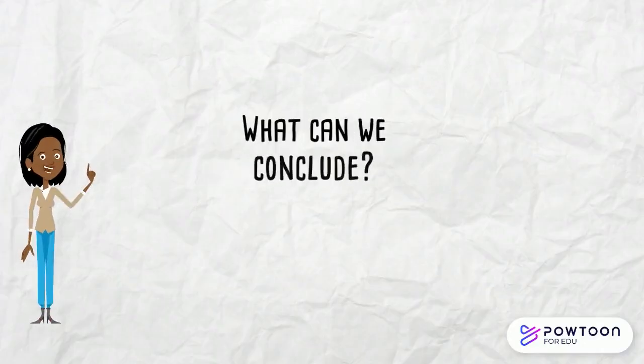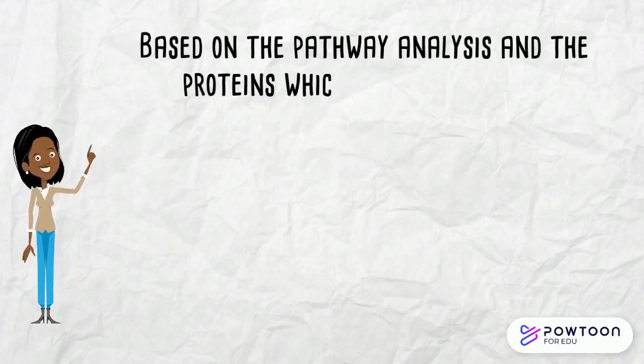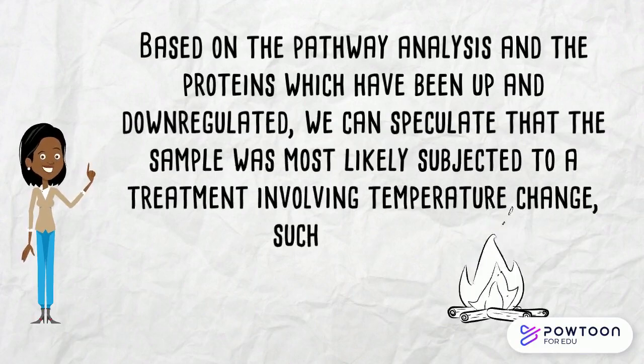So, what can we conclude? Based on the pathway analysis and the proteins which have been up and down regulated, we can speculate that the sample was most likely subjected to a treatment involving temperature change, such as heating.